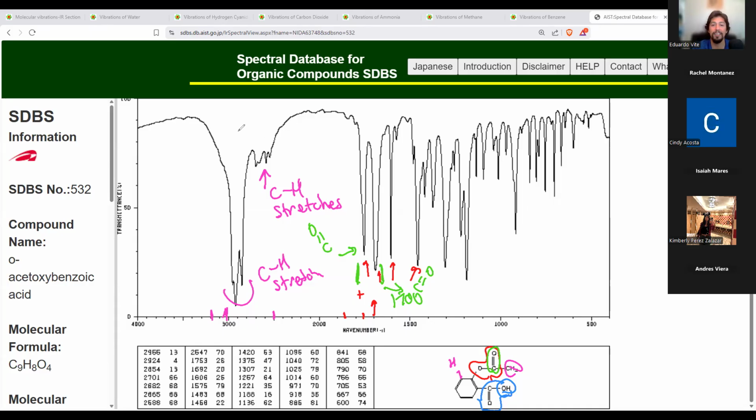And so carboxylic acids, we looked for that wizard's beard, and it doesn't look like the previous examples very much, but if you look at the width of the signal, it starts over here at around 24 and it goes to around 32. That's a pretty wide signal. And it's in the structure. You see there's a carboxylic acid in the structure.